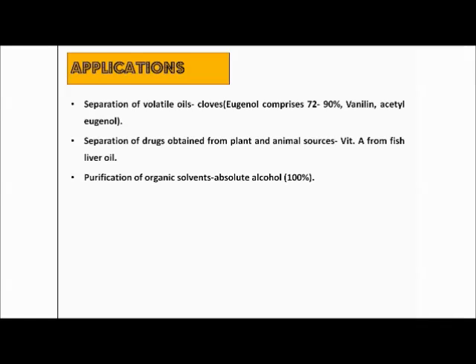For example, absolute alcohol. We know that absolute alcohol has 100% ethanol, right? So for preparation or purification of organic solvent, we need to perform distillation. For example, preparation of absolute alcohol. Next, purification of drugs obtained from chemical process.